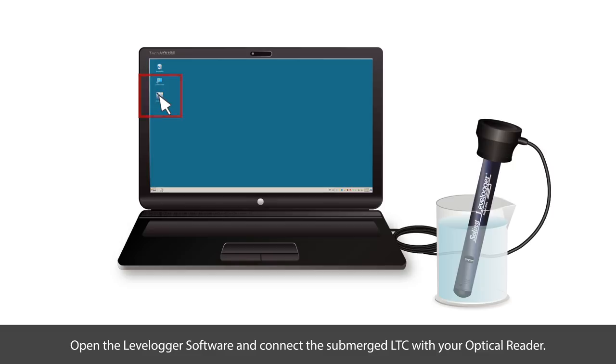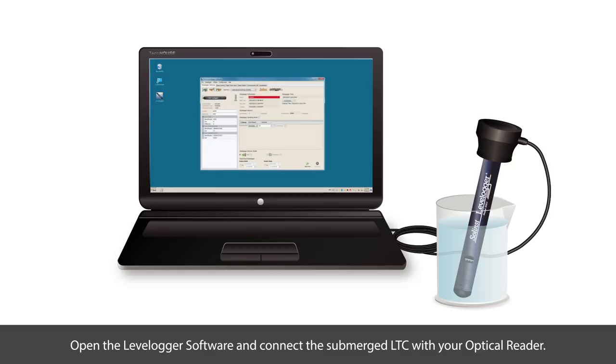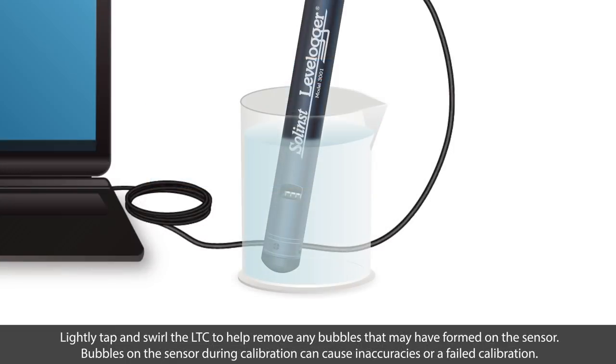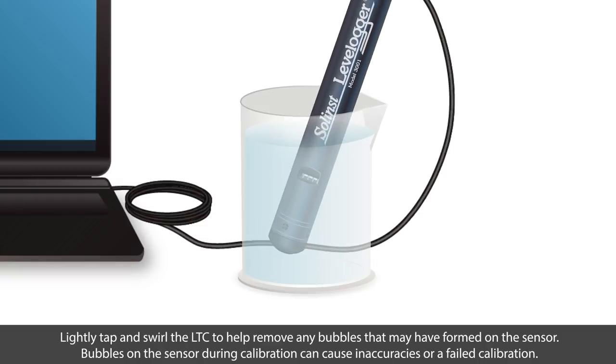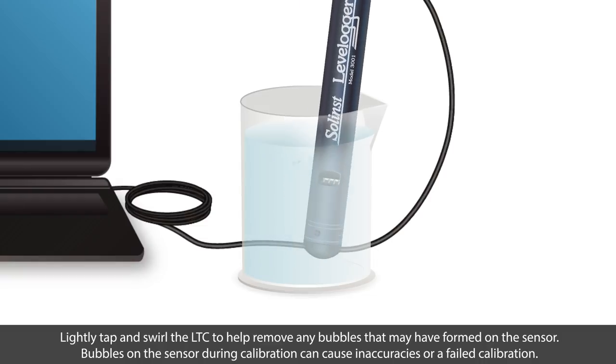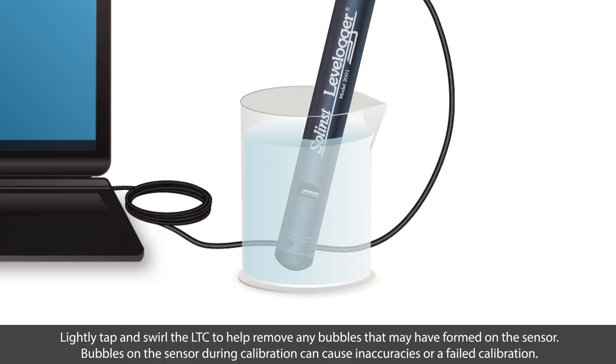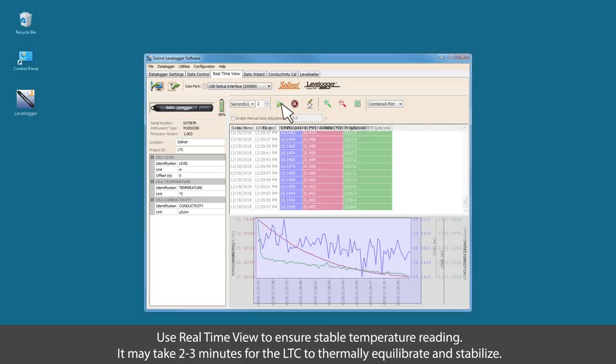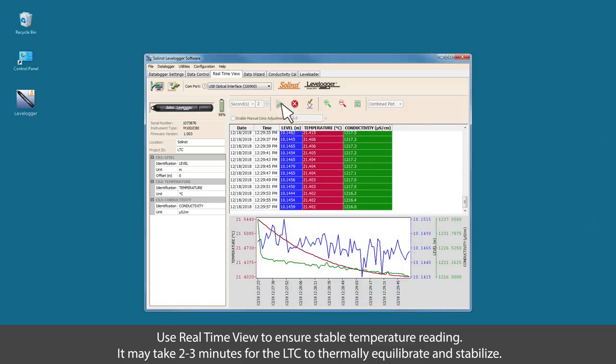Open the level logger software and connect the submerged LTC with your optical reader. Lightly tap and swirl the LTC to help remove any bubbles that may have formed on the sensor. Bubbles on the sensor during calibration can cause inaccuracies or a failed calibration. Use real-time view to ensure stable temperature readings. It may take two to three minutes for the LTC to thermally equilibrate and stabilize.